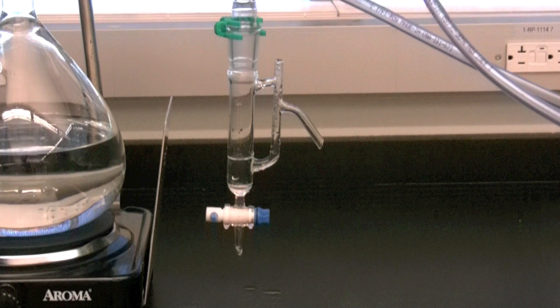Fill the receiver with distilled water such that the water level is at least as high as the top of the lower outlet. The metal heat shield should be between the receiver and the hot plate.